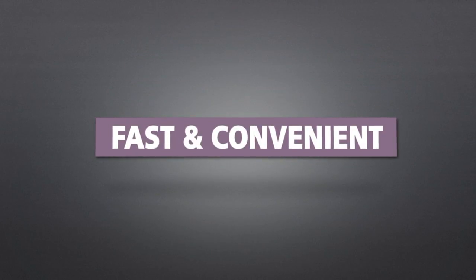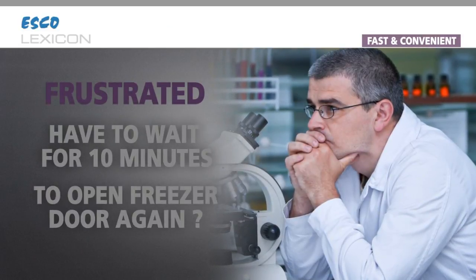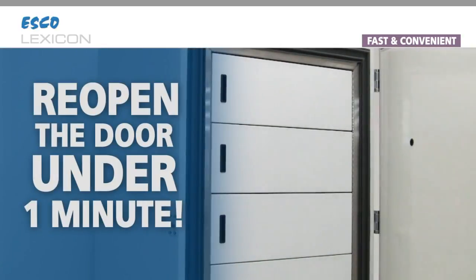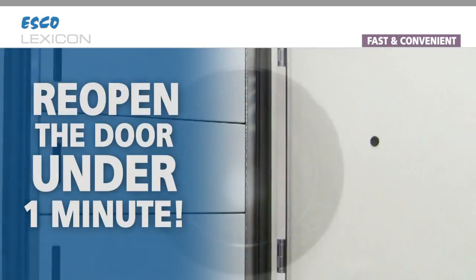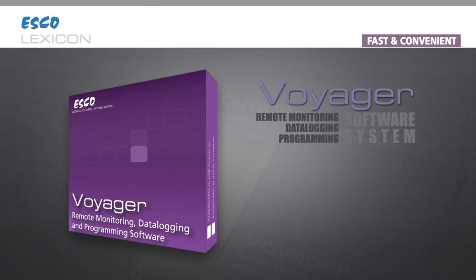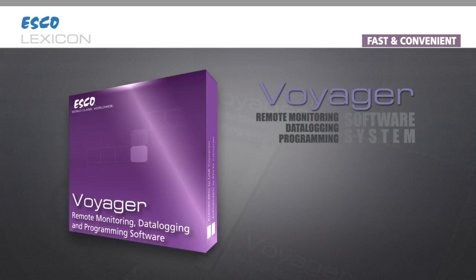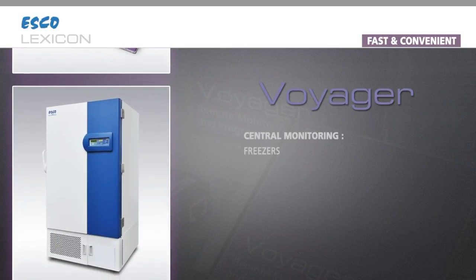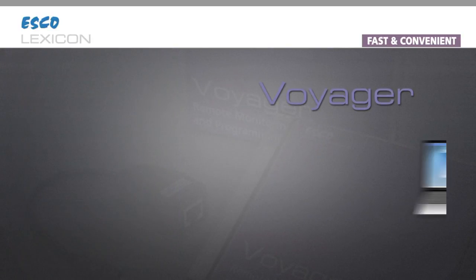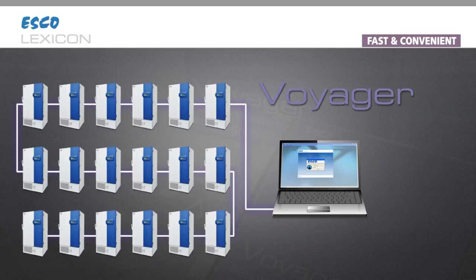Fast and convenient. Frustrated that you have to wait 10 minutes to open that freezer door again? Now you can reopen the new ESCO Lexicon freezer door in under one minute. I am designed with an improved pressure equalization port that makes door reopening a breeze. I am also designed to be compatible with the Voyager software, which allows central monitoring of all ESCO freezers, CO2 incubators, and other temperature-controlled equipment. You could change the temperature setting of up to 16 freezers conveniently while sitting in front of a single computer screen.